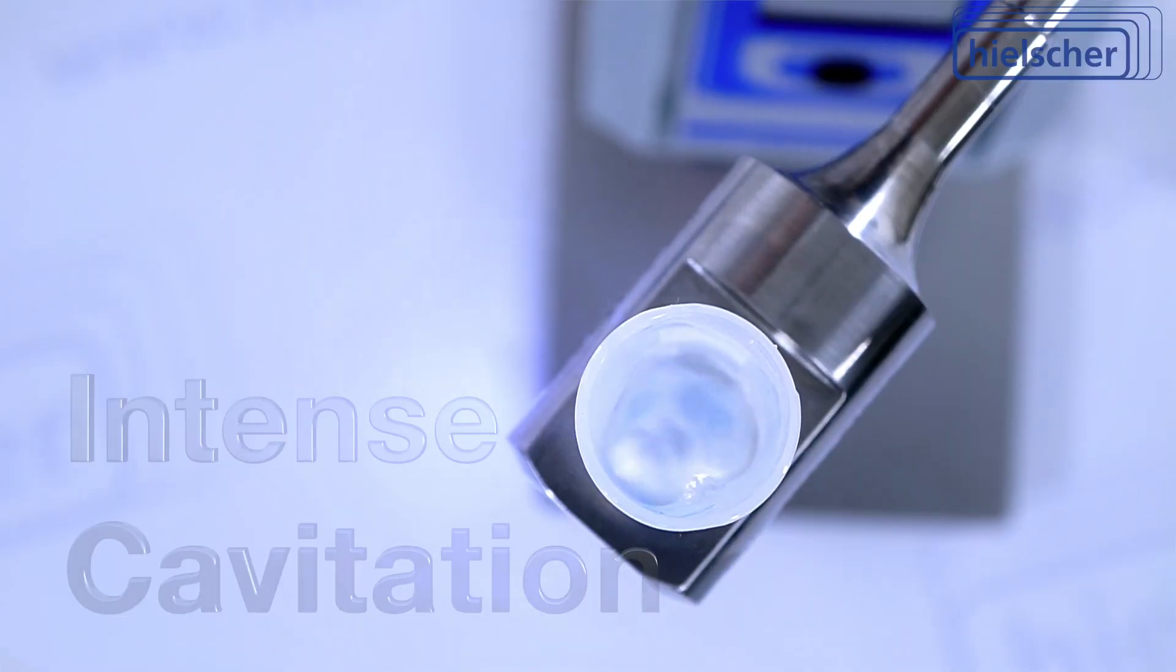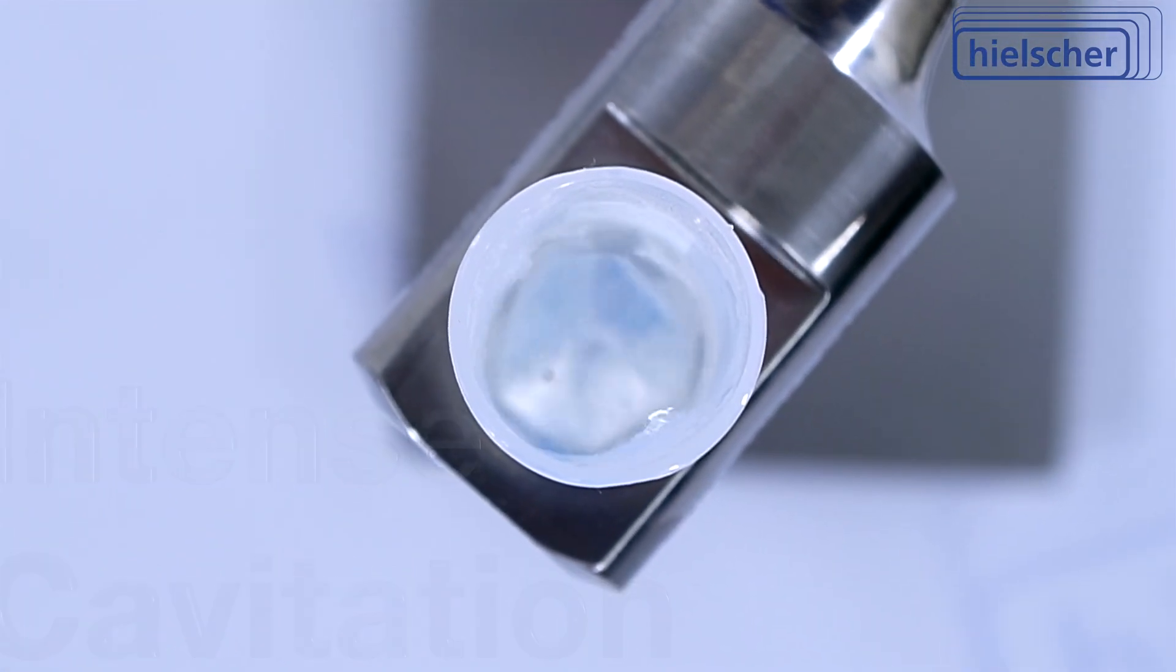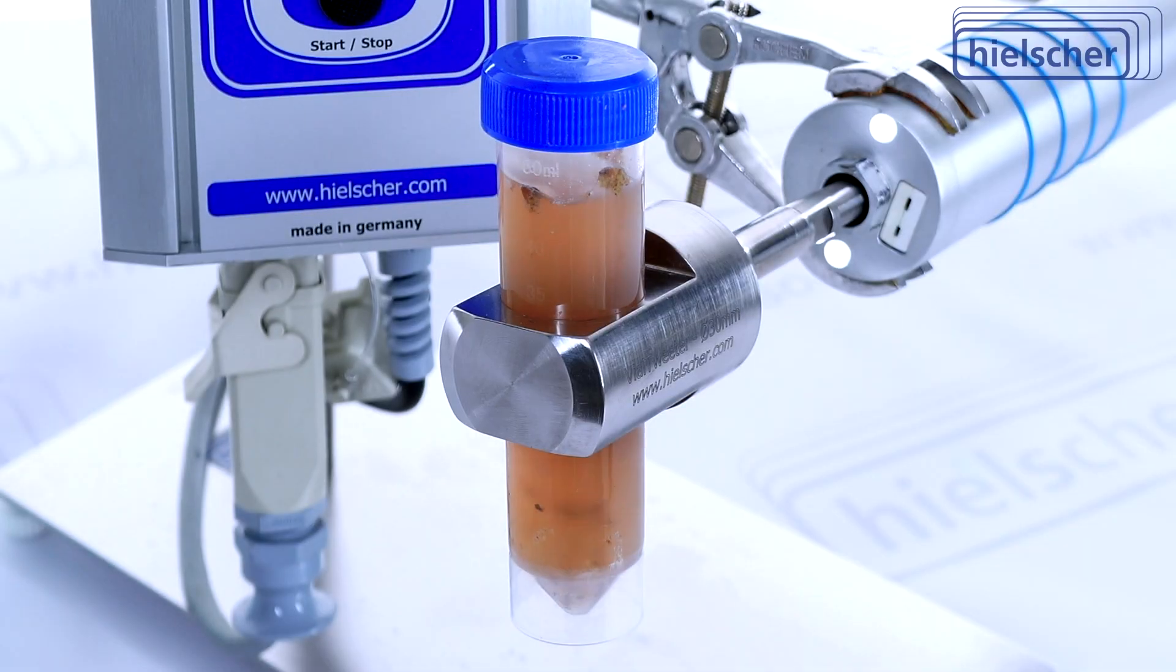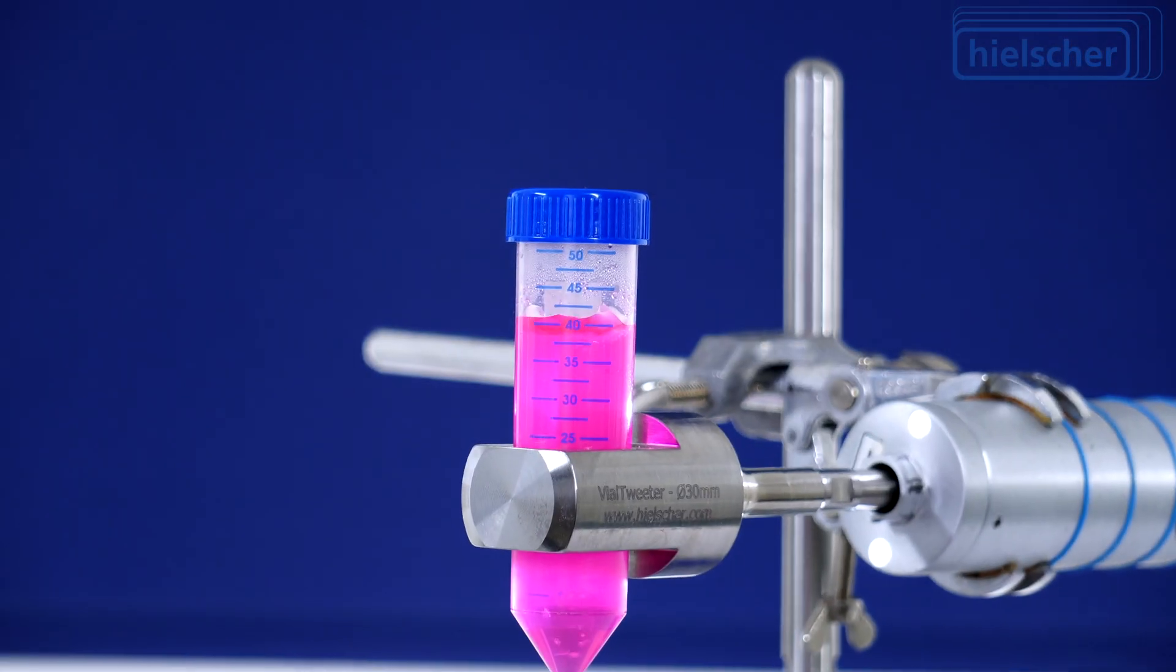By concentrating such intense cavitation in a small volume, the Vial Tweeter delivers about 200 times the intensity, significantly reducing processing time, ensuring more thorough sample treatment, and improving sonication results.